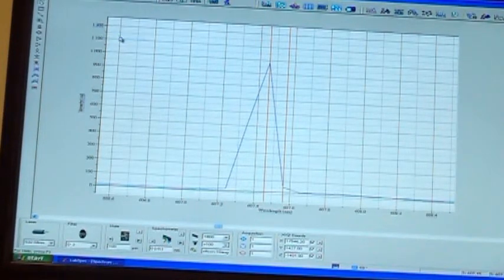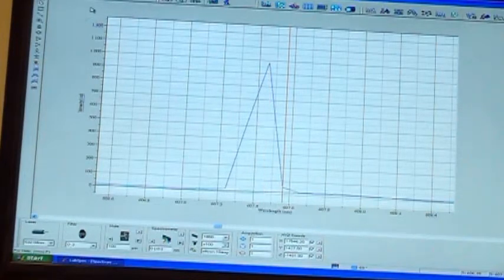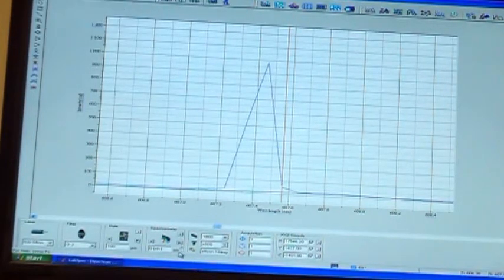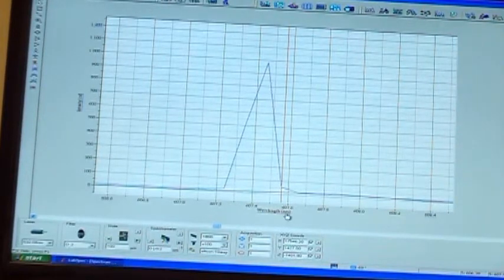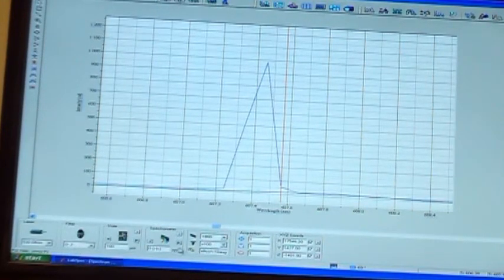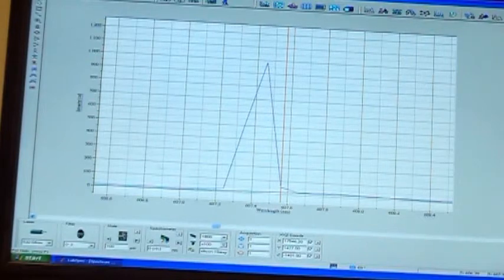So we can turn this off. So let's see, options, unit. For example, now we turned off auto convert, and here you can see we're in nanometers. So if I come back up here to options, unit, and I say wave numbers, my spectrometer has changed to wave numbers, but my data displayed still says nanometers. So then if I come up here, options, change back to nanometers, my spectrometer now is ready. It says nanometers in the spectrometer.